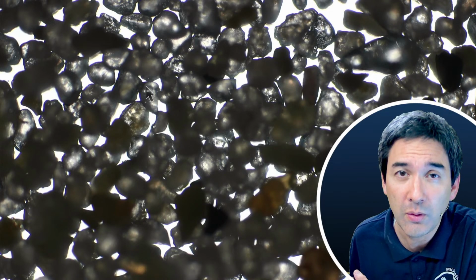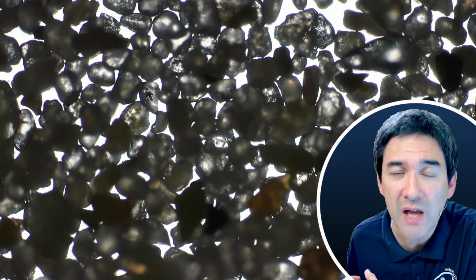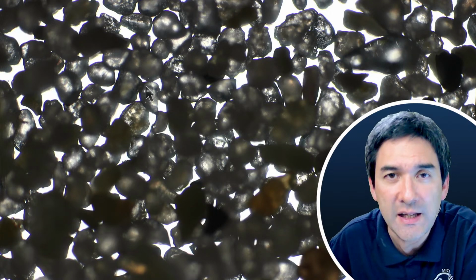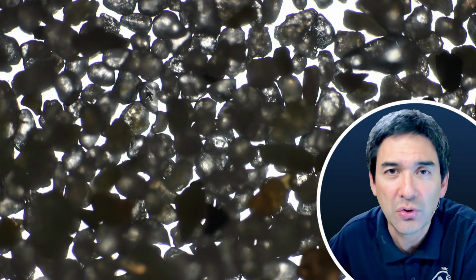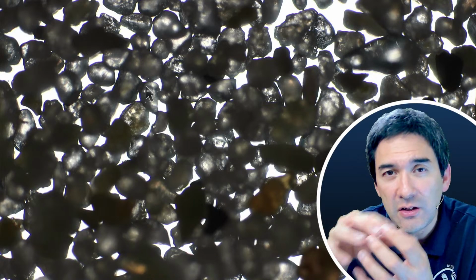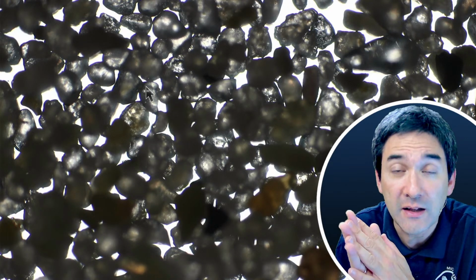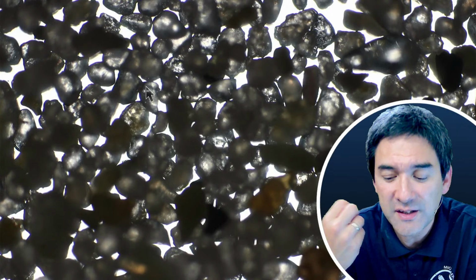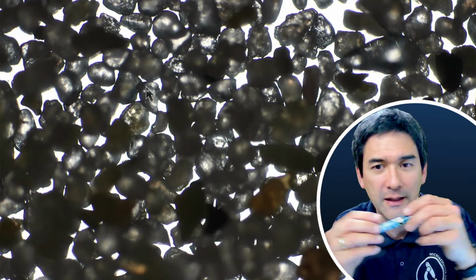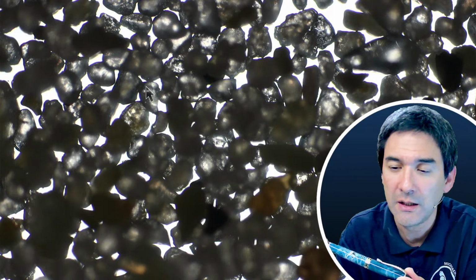But when you want to do that, then do not use epoxy glue, but there are those very liquid epoxy resins that people use to make tables, furniture, or put objects into this clear epoxy. There are many YouTube videos out there that demonstrate how to do that. I don't know how this technique is called, but essentially you can take pretty much any object that you want, I don't know, like this pen here, and put it into a box surrounded by epoxy, right?